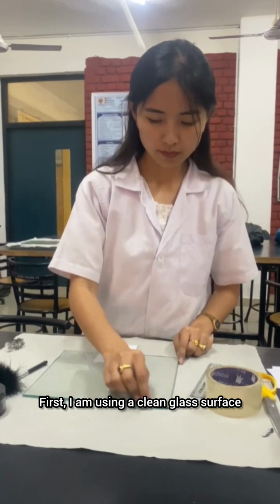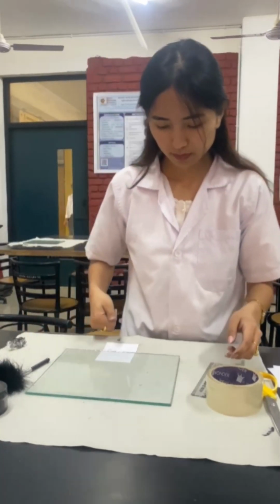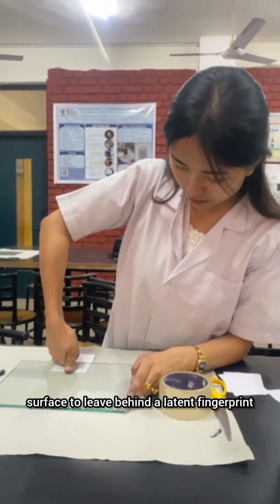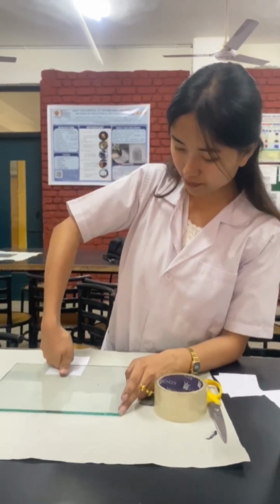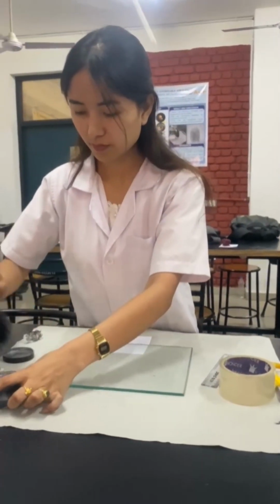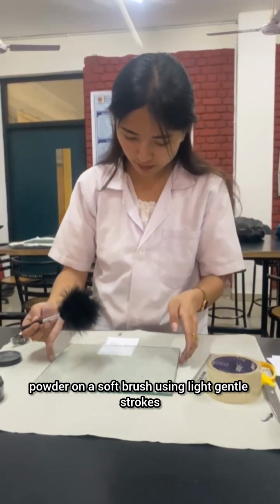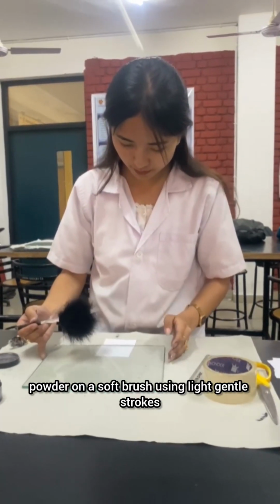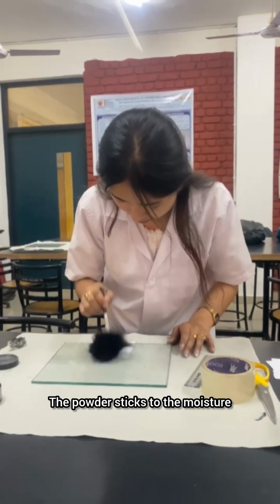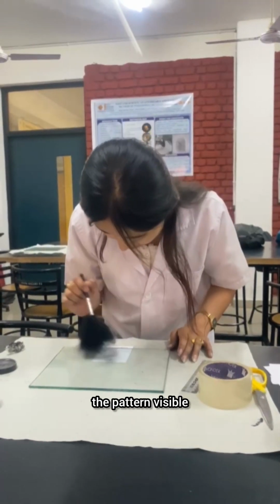First, I am using a clean glass surface, which is a non-porous material ideal for collecting fingerprints. Next, I press my finger firmly onto the glass surface to leave behind a latent fingerprint. Thus, a fingerprint not visible to the naked eye but still present. Now I take a small amount of black fingerprint powder on a soft brush, and using light gentle strokes I dust over the area where the fingerprint was placed. The powder sticks to the moisture and the oil left by the fingerprint, making the pattern visible.